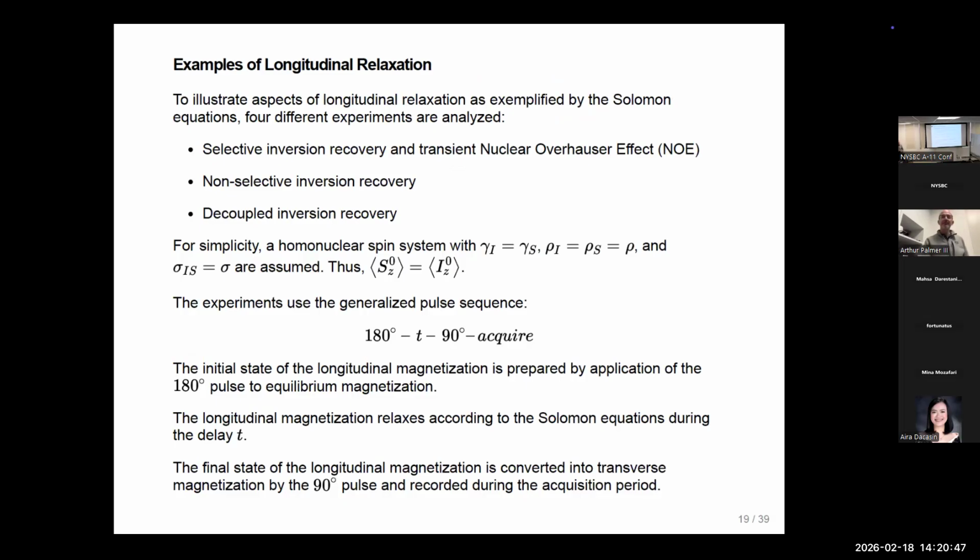We'll probably skip through some of this because a lot happens in these experiments with Z magnetization, depending on what you do to the two or more spins. So for example, at Boltzmann equilibrium, nothing is happening. Everybody's just exchanging at equilibrium. There's no net change.